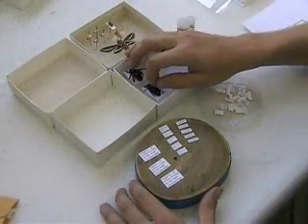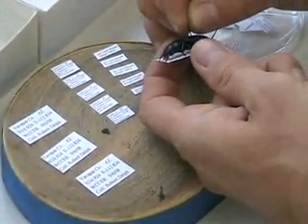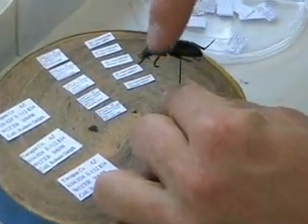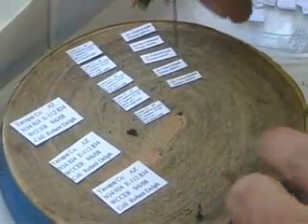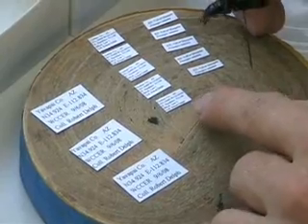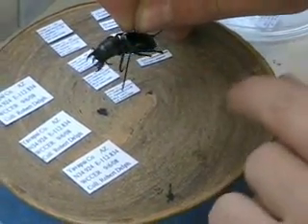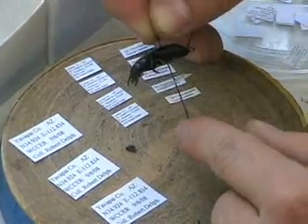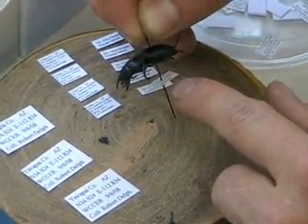After specimens have been pinned and are dry — it usually takes about 24 hours — you can then take the piece of paper from underneath your specimen, and the legs and mouth parts, however you display them, will be in that position. Then you can put the labels on. With pinned specimens, you pin it right through the center of the label, making sure the pin is not affecting any of the words. Leave enough space so you can read the information on the label; if the label is too far up, you won't be able to read it.